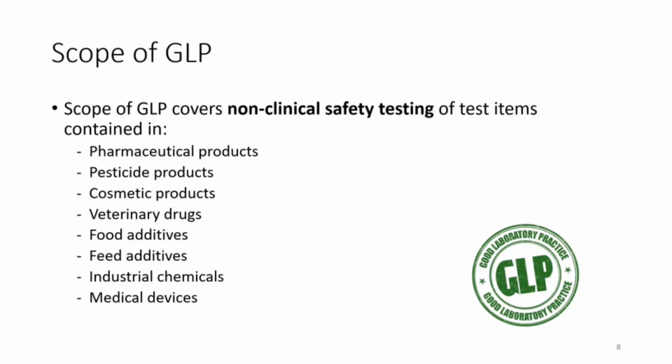GLP covers the non-clinical safety testing of test items across a wide range of industries, including pharmaceutical, biomedical, food, veterinary, and also chemical industries. So it is very relevant to all of you because it covers all your diploma courses.